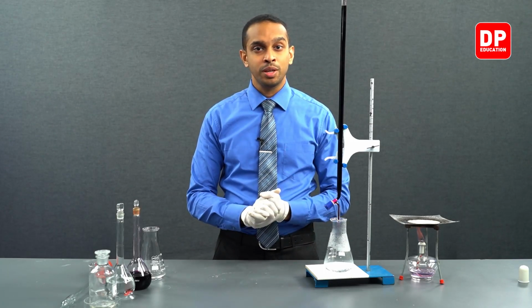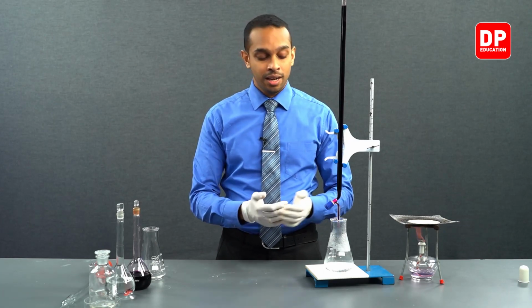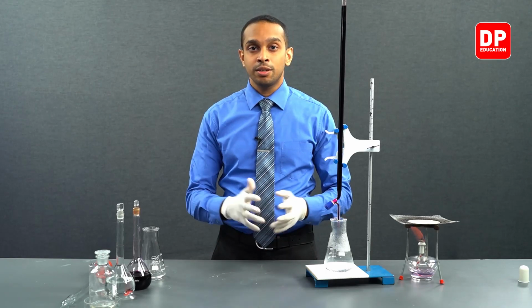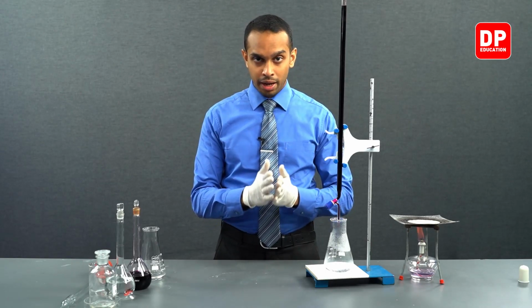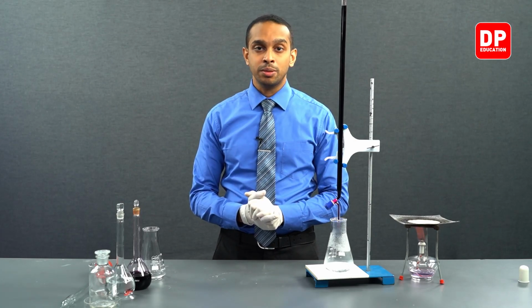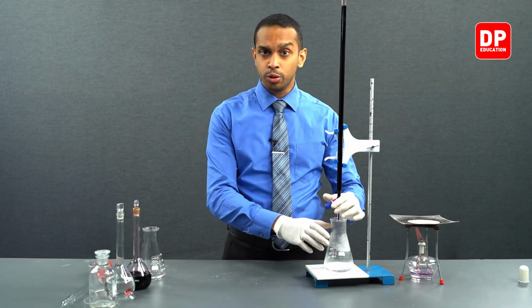So let's say till about 25 cubic centimeters, you can add our potassium permanganate rather rapidly. From that point onwards, you can take it slow and add potassium permanganate into this titration flask little by little. So let's go ahead and do that.